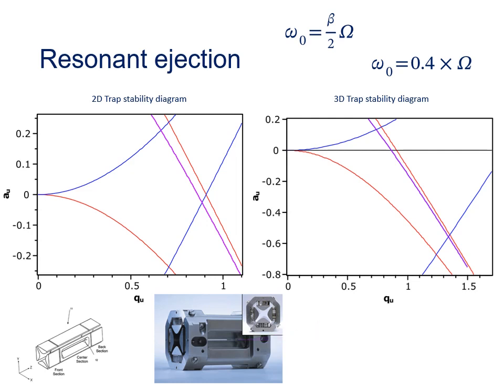And just like the holes in the end caps of an ion trap, the slots in the X rods in a linear ion trap are there to let the ions be resonantly excited out of the trap and onto the detectors. As a result of this resonant excitation, we know the ions are going to go unstable in the X direction, but there are two X rods and it could come out of either one. So to maximize your ability to detect ions coming out of an ion trap like this, you need to have detectors on both sides, not just on one side.